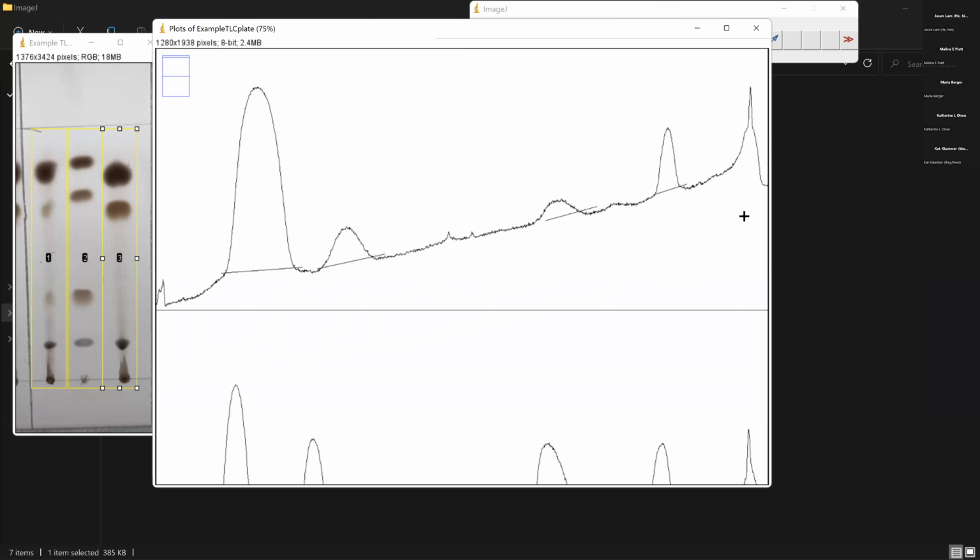If I want to undo the first line that I messed up on, I'm pressing Control-Z over and over, and it just makes that last line that I drew disappear and come back. So once I've drawn a line and then drawn another line, you can't go back and fix the first one. The only way we found is to close down the program, start it back up, redraw your rectangles, and then get your chromatograms again.